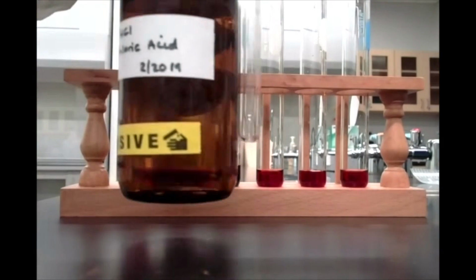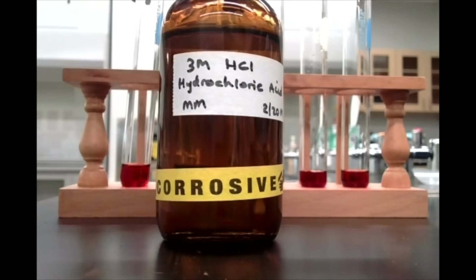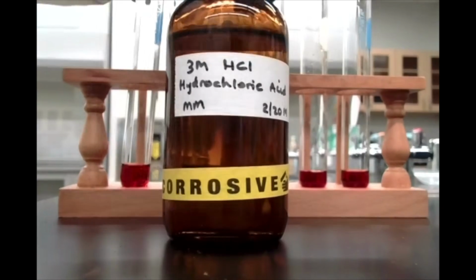Okay, so now for test tube number 4, we're going to take a concentrated solution of hydrochloric acid. All right, so this is 3 molar HCl. Hydrochloric acid is going to react with our Fe3+ ions in solution and form an iron chloride complex, which basically prevents the iron ions from reacting with thiocyanate. So effectively, this is going to remove that reactant, Fe3+, from the solution. Think about the effect this is going to have on your equilibrium accordingly.